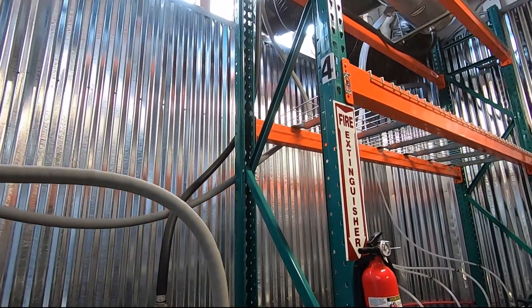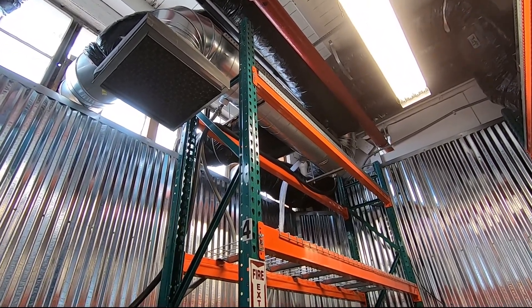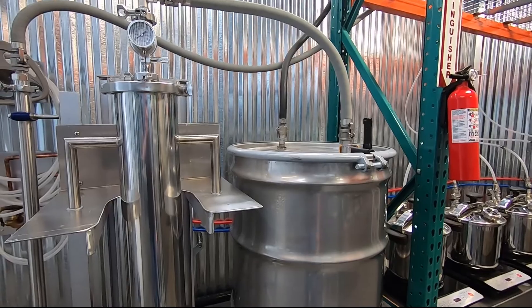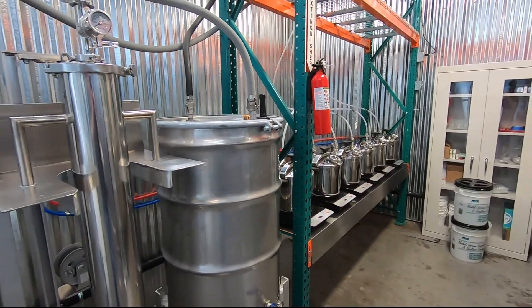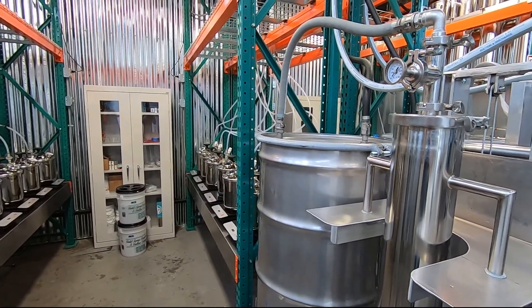From there I've got a 55-gallon collection drum that's vented, and this again goes up to the shell of our condenser so we're venting everything outside — any vapors just get shot outside. That's the system: no chillers, really inexpensive. Just running multiples of these guys, I've probably saved hundreds of thousands of dollars in equipment running this type of system.